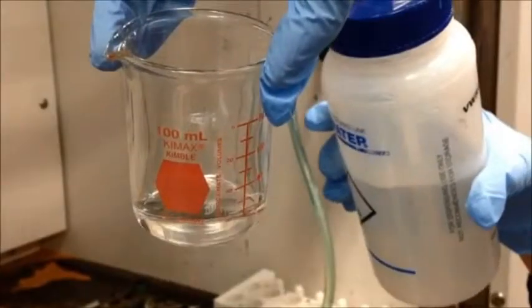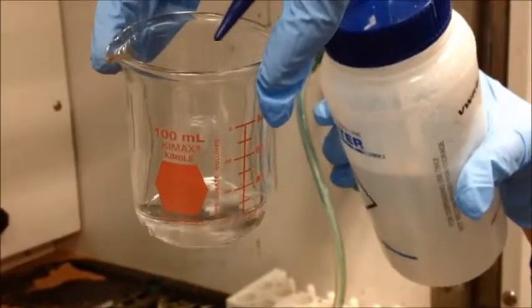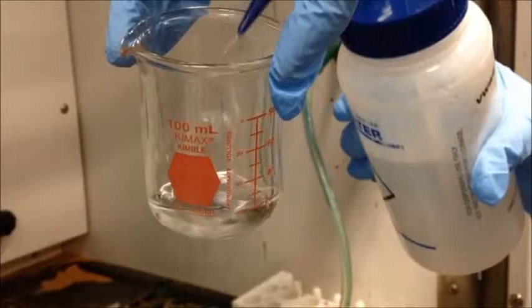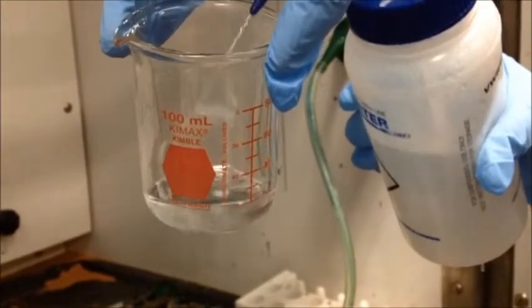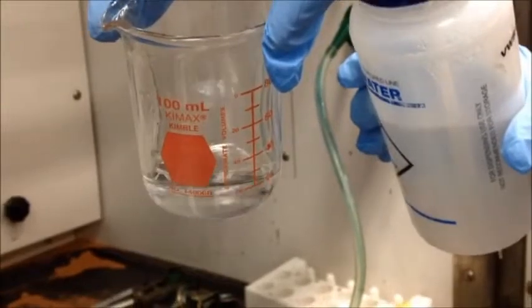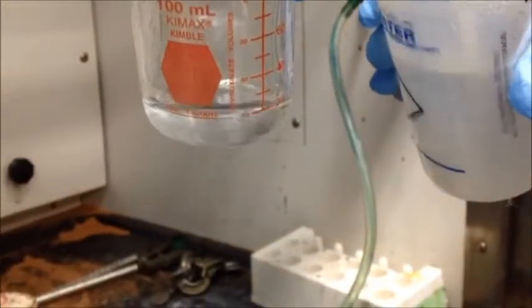Just to double check and make sure that our experiment worked, we performed two tests. We first smelled for ethanol by wafting the scent towards us, and it became immediately evident that ethanol was the liquid present. Our second test was adding water to the beaker containing our liquid. This resulted in wisps appearing as the two liquids mixed, which is indicative of an alcohol being present.